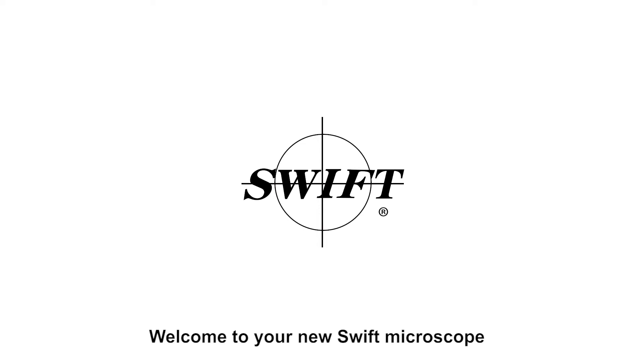Welcome to your new SWIFT microscope. SWIFT has been trusted by educators, researchers, and clinicians for over 50 years to deliver lab-grade optics to awaken the scientist within.